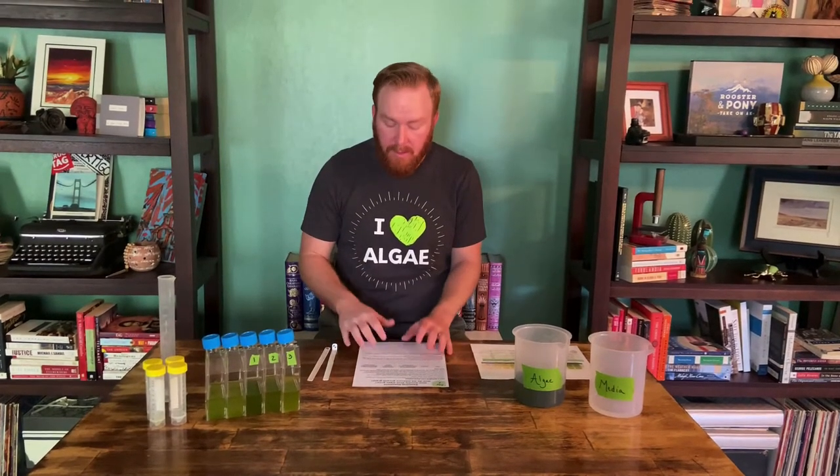Hey everyone, I just wanted to go ahead and give you a quick tutorial on how we are going to sample our algae cultures to estimate the amount of biomass that's actually in the culture — the amount of algae that's there.